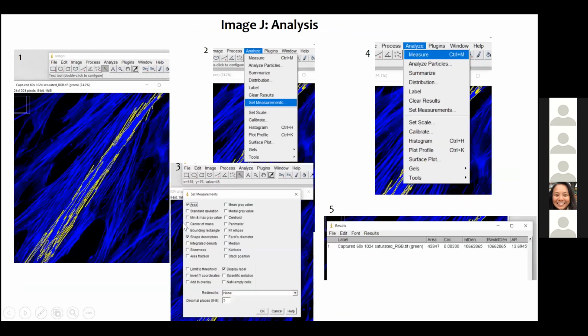And then lastly, coming on to the analysis part, again, you can use the dedicated confocal microscope software that is available. But if you have to use ImageJ, I'm just going to show you how to measure the integrated density. All I did was choose a wand here, and you can either make a sample, you can make an ROI yourself, which means region of interest, by the way, or you can highlight or pick up anything you want.